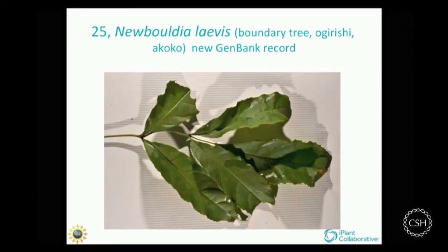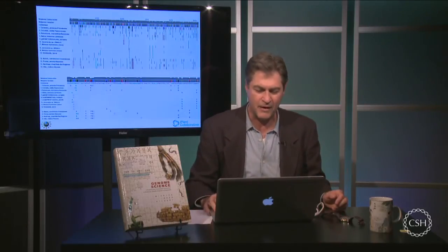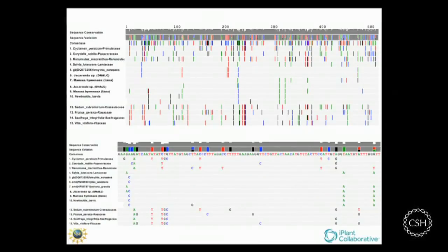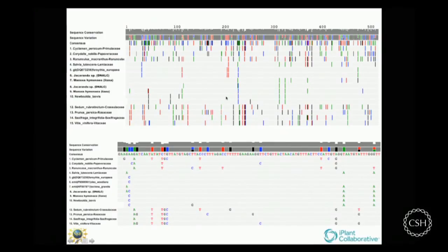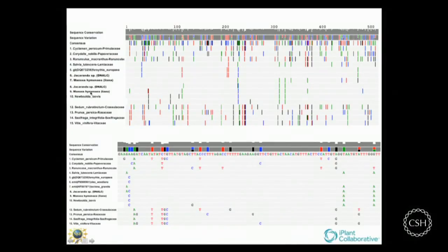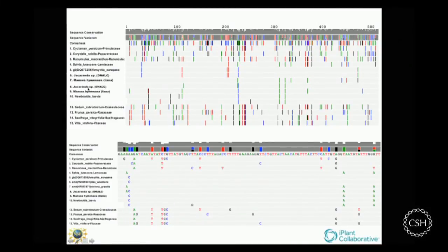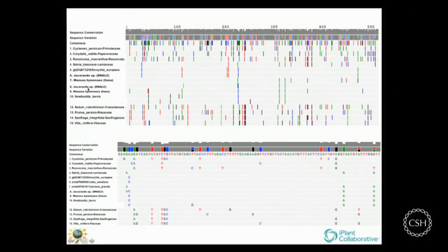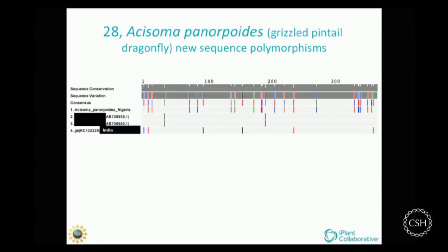I could show you the analysis. Very interesting local tree, important to their society for making boundaries, setting off monuments and so forth. And what did I find with this? Here's the sequence analysis. And what did I find? Here's my tree here. It's not in GenBank either. And it's related to lianas and jacarandas. This was a sequence that we actually published, and my sequence came up in the database search. So here's another new sequence record, and it's a lot of fun.